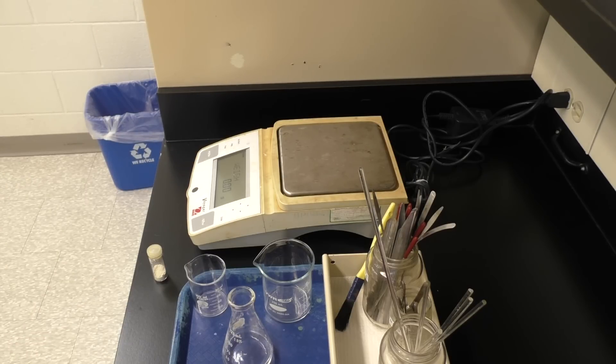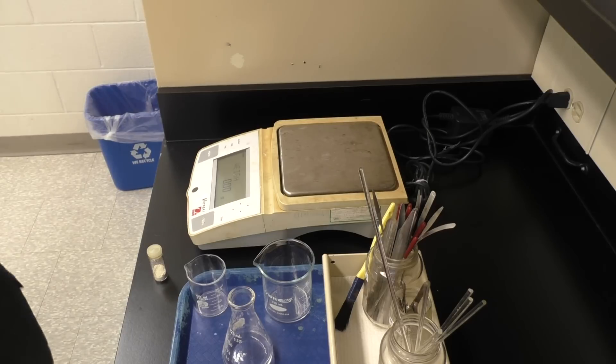As far as the weighing and transferring of your unknown, you're also going to need a pipette, a disposable pipette and a pipette bulb. These are at the front of the room.